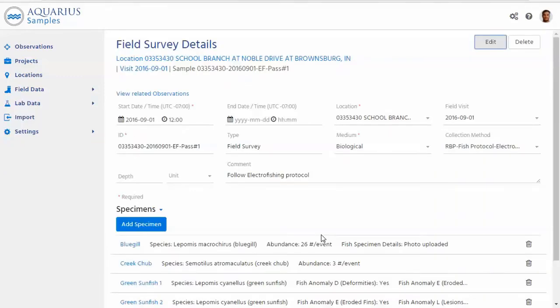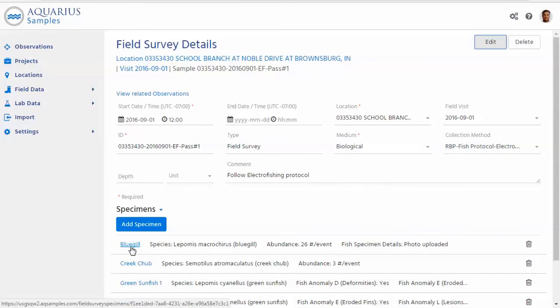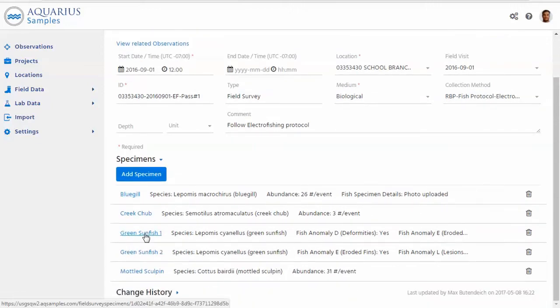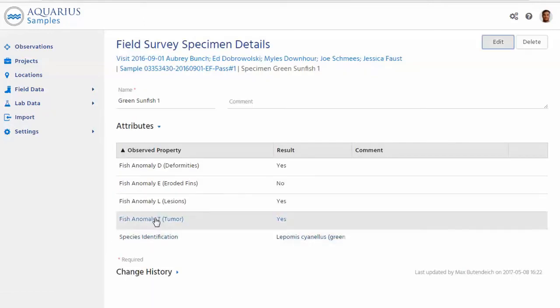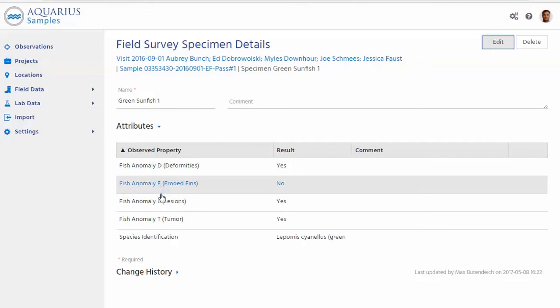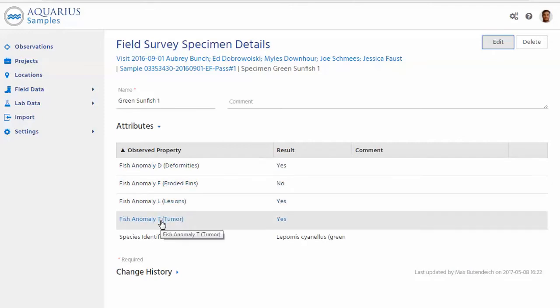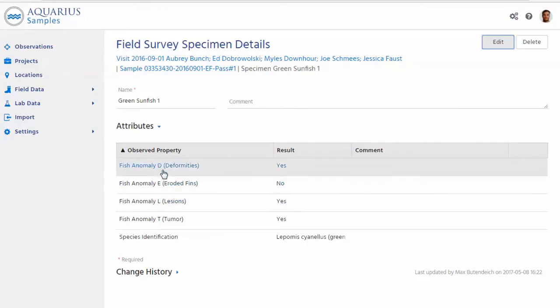Let's continue looking at specimens that are part of a field survey. As we said, a specimen could either be a count or it could also be describing one individual specimen. Let's look at one of these, which are individual specimens of green sunfish in this case. So I'm going to look at one of those and we can see here somebody describes an individual sunfish by types of anomalies about lesions, tumors, deformities. And by the way, all of those are fully configurable to whatever your organization needs.